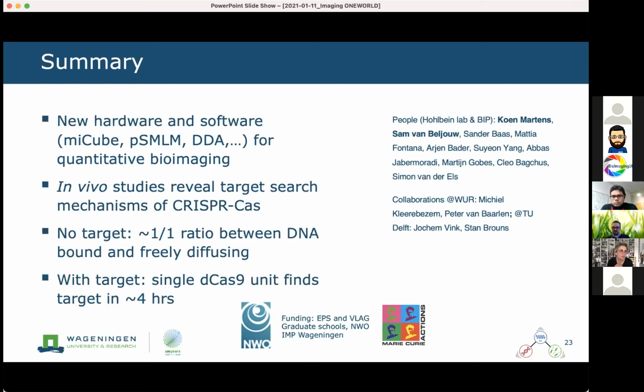I guess my question was a bit cheeky, but for the big companies it must be quite terrifying, because if I can make my own light sheet microscope for, let's say, 10-20,000 pounds, but I can buy one for 600,000, there has to be a huge difference.